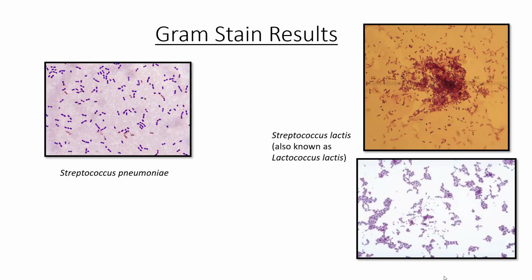So one of the things this image demonstrates is that the streptococci do not always show a strepto arrangement. Interestingly enough, many of the species that are taxonomically identified as belonging to the genus Streptococcus do not actually show a strepto arrangement under the microscope, but rather are grouped in with the Streptococcus genus because their DNA indicates that they're evolutionarily related to other more prominent Streptococcus species such as Streptococcus pyogenes.